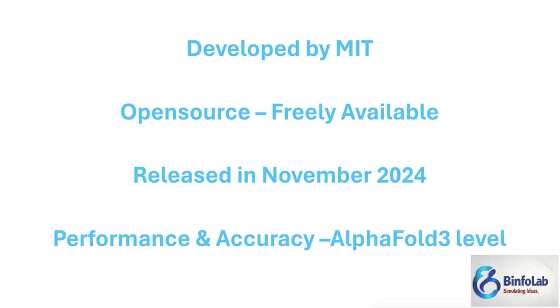It gives performance and accuracy almost equal to that of AlphaFold 3. Above all, it is developed by a research group working at MIT, and it is open source. It means it is freely available.